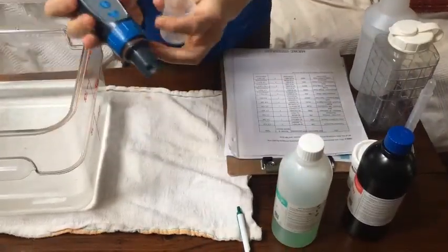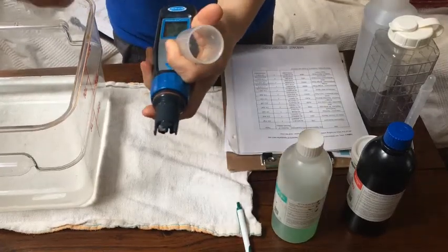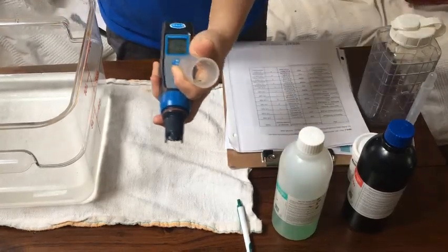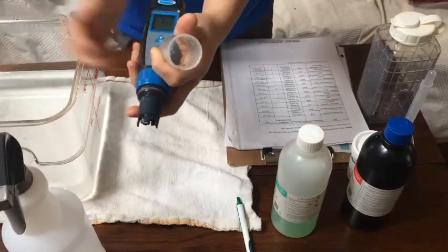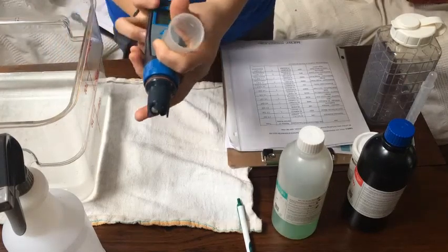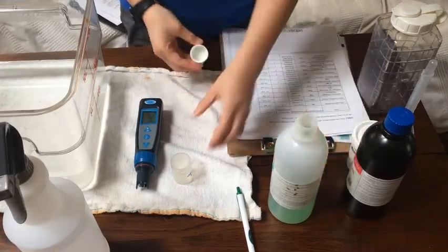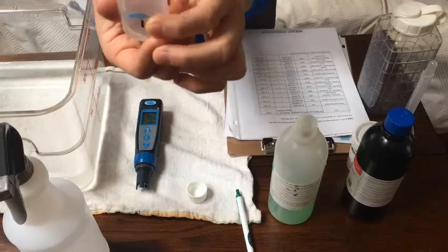Uncap it. We have a rule: anything that goes in the cap needs to be sprayed down. You have DI water here. I've already sprayed it down, but you spray both inside the cap and onto the monitor.